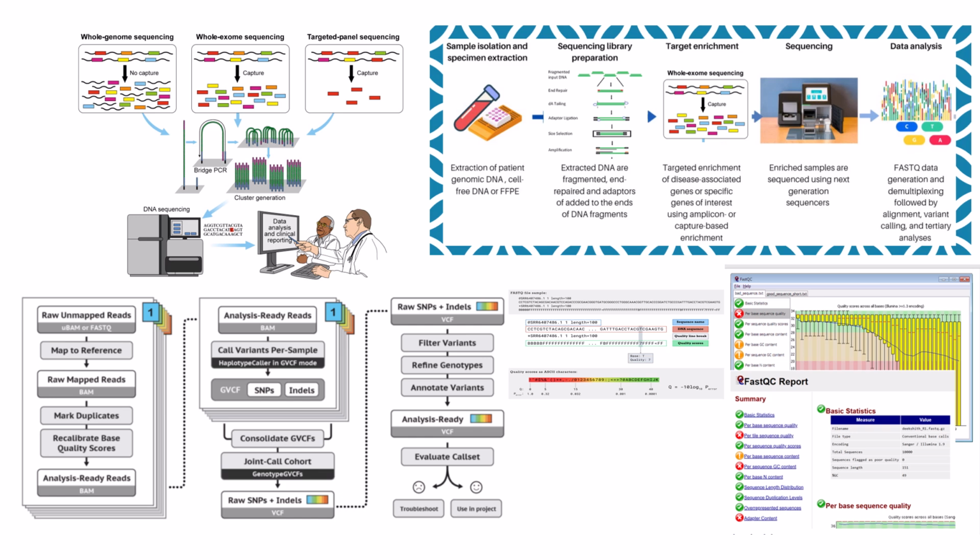And the output of this step, what does it look like? It generates a file, typically first a GVCF, then processed into what's called a VCF file, variant call format. This VCF file is essentially a detailed list of every potential genetic variation identified in the patient's sample compared to the reference. So this VCF file is the raw list of potential differences.